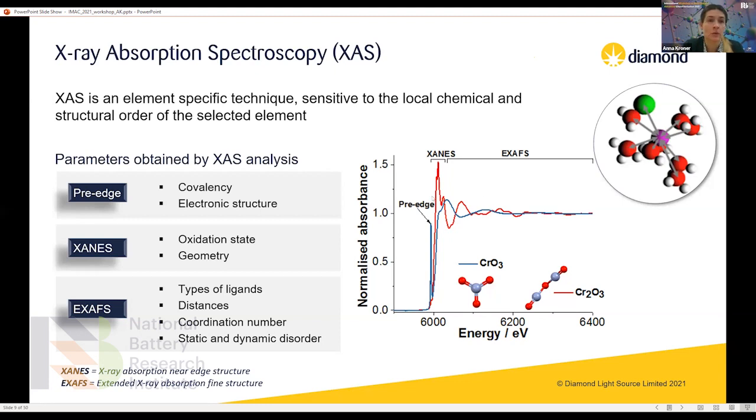And overall the XANES features look very different. So in the simplest measurement, and specifically we really want to study the XANES, we perform the measurement on a sample, and then we have a range of references which are measured and then compared to the studied sample. And that really is the simplest way of fingerprinting. There is a much more advanced possibility to study this region using modeling and advanced calculations, but this is still quite complex and still under investigation.